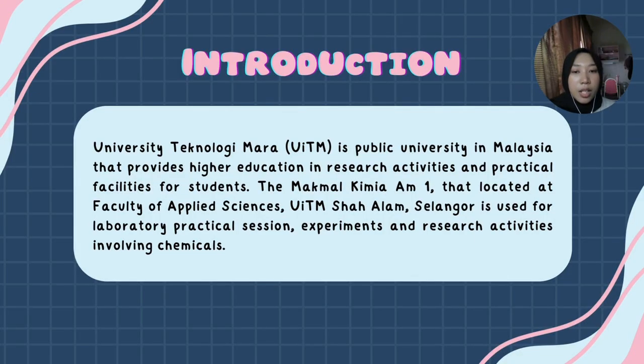Since the laboratory involves the use of different chemicals during daily activities, there is a possibility of exposure to chemicals hazardous to health (CHTH). Therefore, this workplace was selected for the chemical hazard assessment.